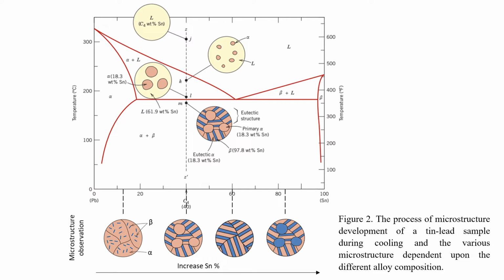As the diffusion rate is slow in solid, this kind of microstructure will be maintained until the temperature drops down to room temperature in this experiment. As a result, the final microstructure observed under the microscope will contain the single-phase alpha region as the pro-eutectic region and the mixture-phases region as the eutectic region.